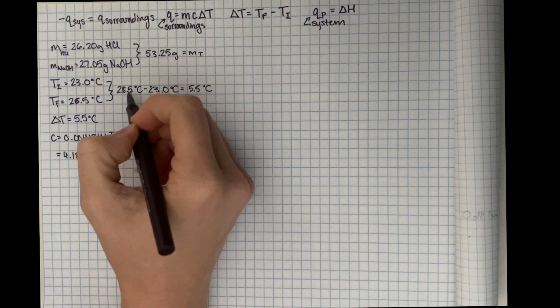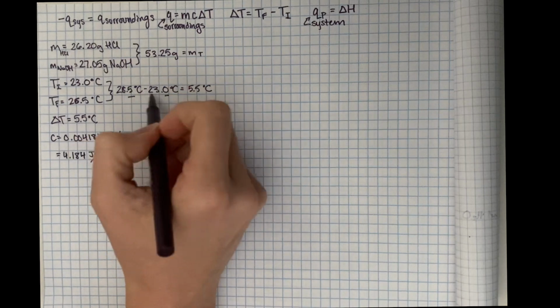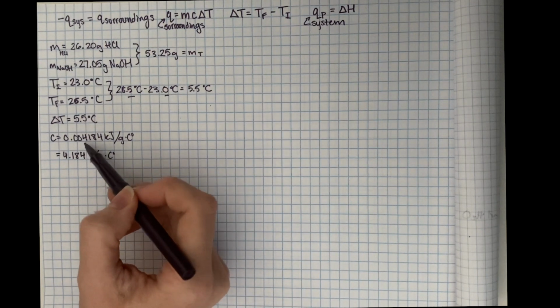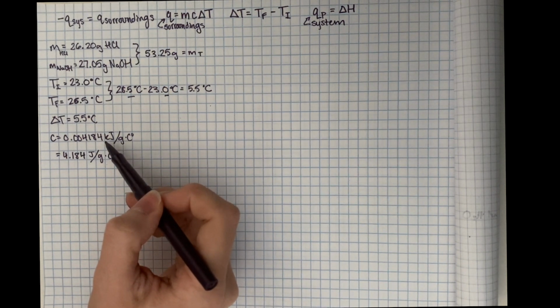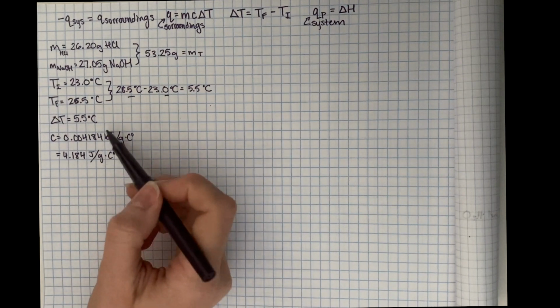Since we're subtracting and we have one decimal place, we record just one decimal place and not the 3 significant figures that each of these are. And we know c. I'm going to use 0.004184 kilojoules because I don't want to convert later. Remember, it's standardly represented in kilojoules rather than joules, but we could also use 4.184. It's preference, but I'm going to use this one here.